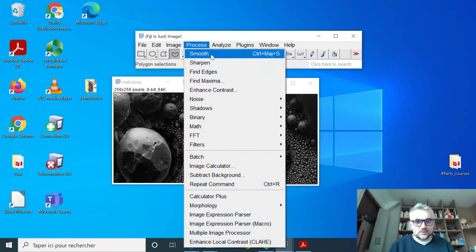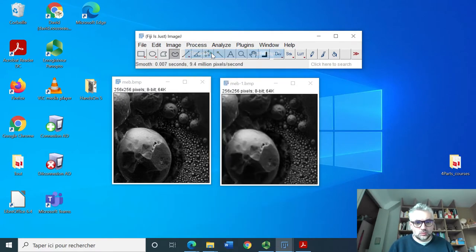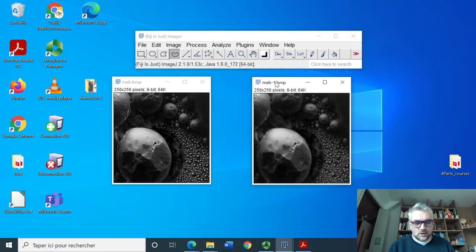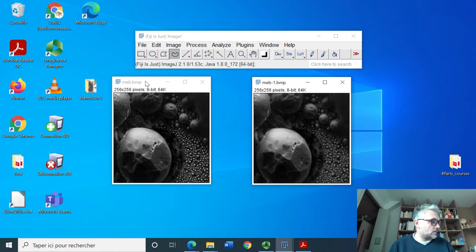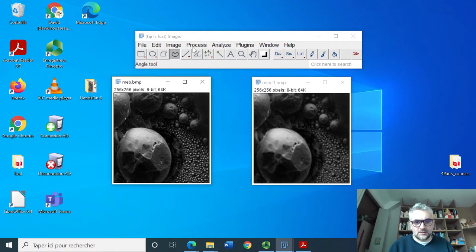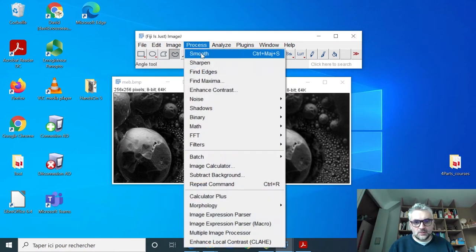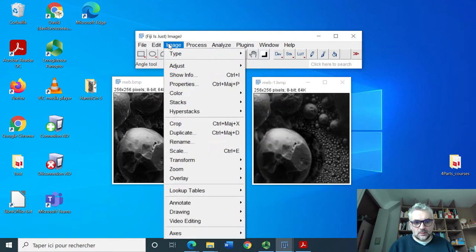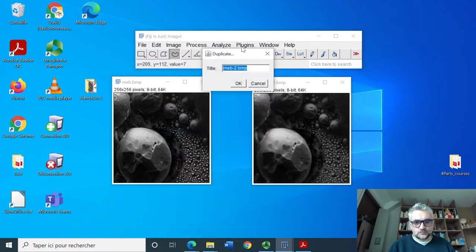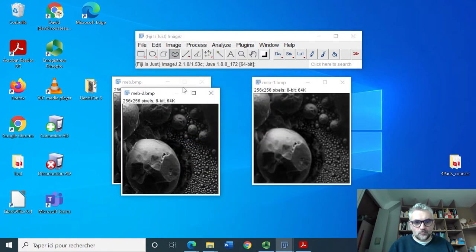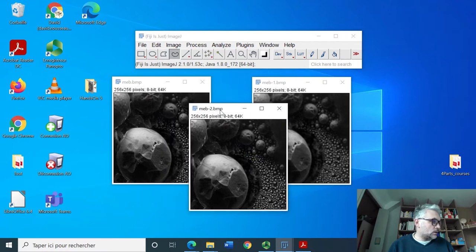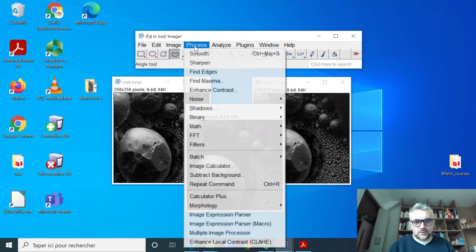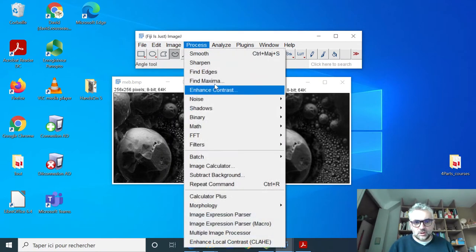We'll process smooth this image, then duplicate again this image and we are asked to process sharpen.